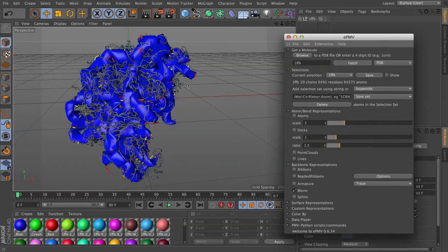So you can see that the default coarse molecular surface has settings that are causing it to shrink way too much to capture the surface.